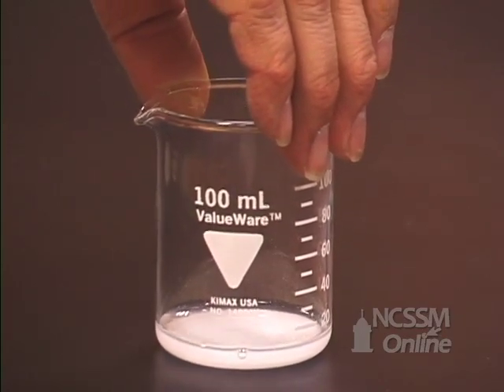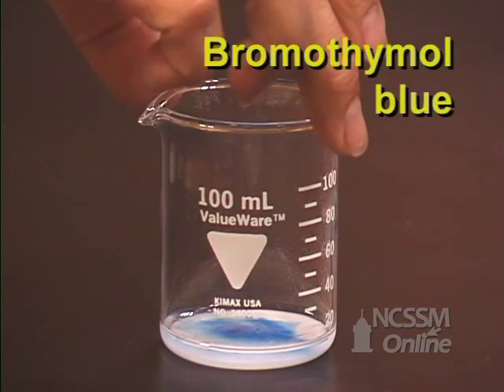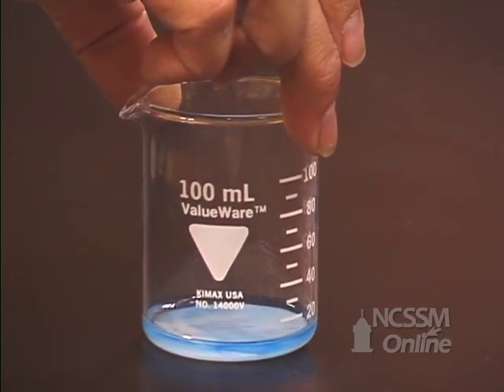We will add a couple of drops of bromothymol blue indicator to the solution. Bromothymol blue is an acid-base indicator — it is blue in basic solution and yellow in acidic solution.